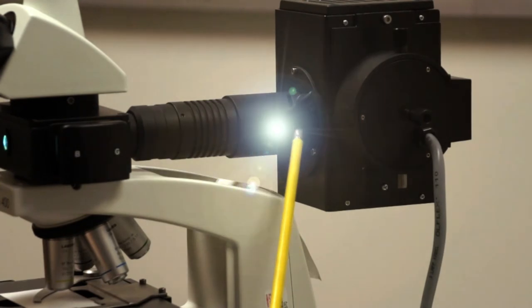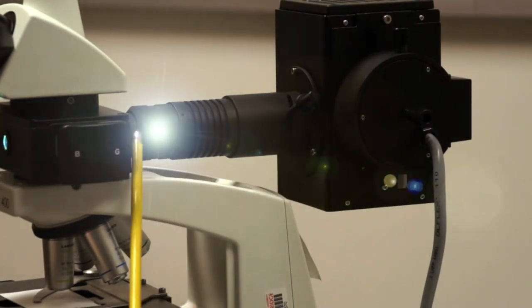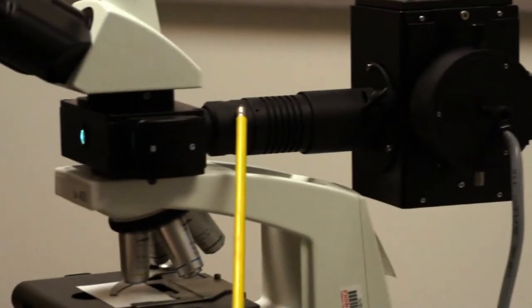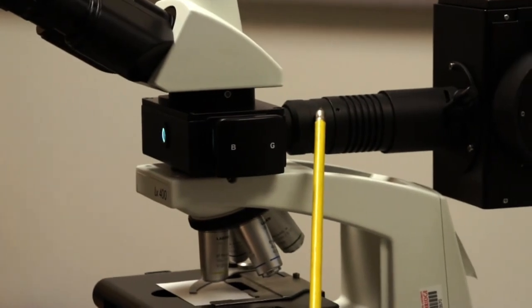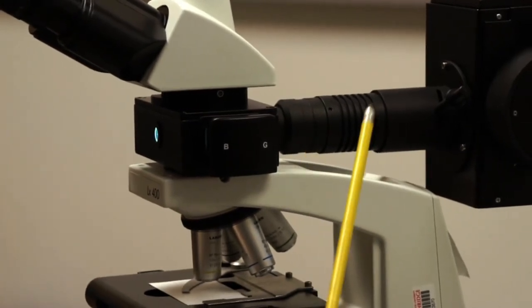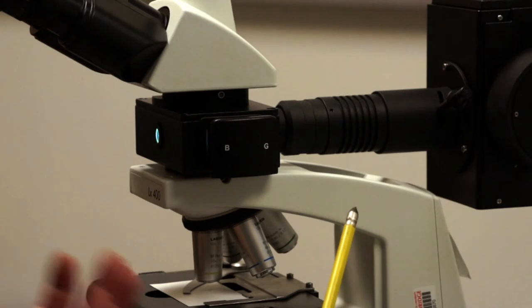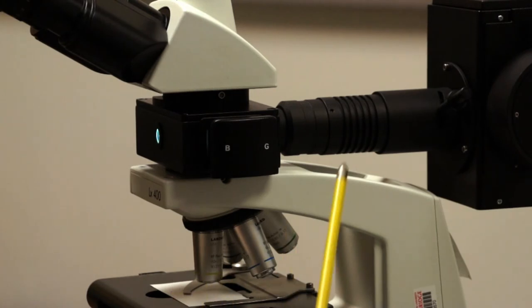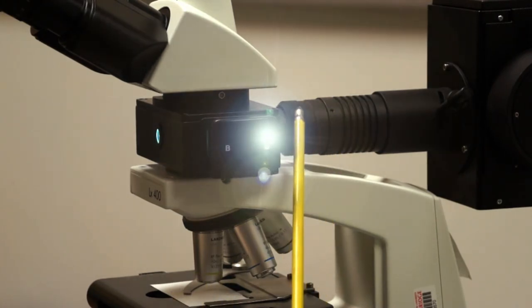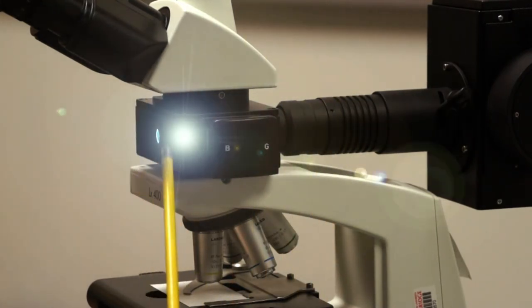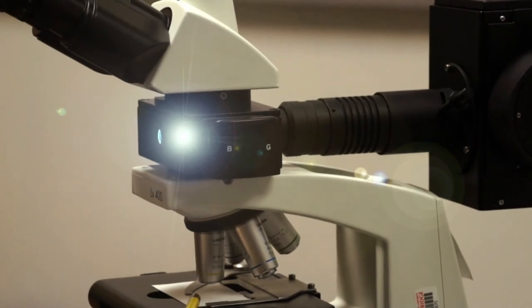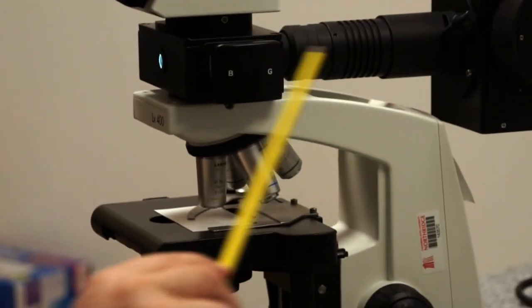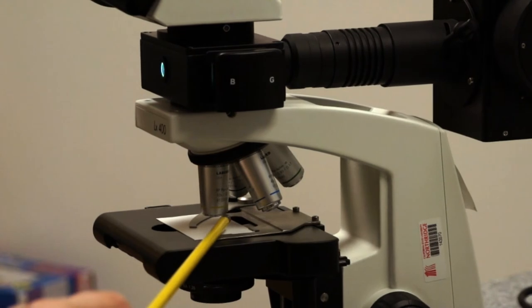But the light travels from the lamp house through the vertical illuminator. It goes through an excitation filter, which is a specific color that's used to excite our fluorophore, which we'll discuss more about later. And you'll see this color in a second. It goes through the excitation filter.